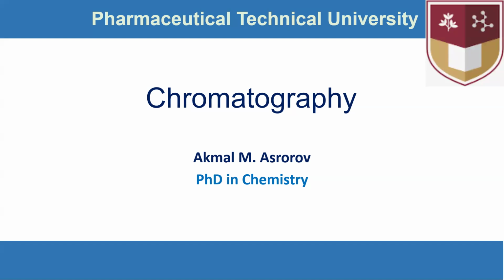In this video lesson, we'll talk about chromatography in general, and some information on thin layer chromatography and column chromatography is provided as well. And in the other two video lessons, we deliver some info about HPLC and gas chromatography. I recommend you all to watch the two other video lessons on chromatography, HPLC and GC, so you might find them useful as well. Here we go.